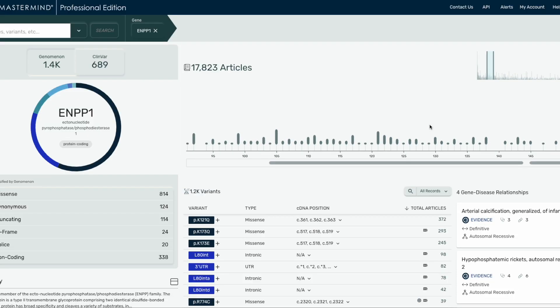As you can see, the new gene page has a lot of new features and enhanced versions of classic Mastermind features. If you want to see the articles for your gene or gene and disease combination, you can click on the article count above the variant diagram here. But let's stay on the gene page for now.